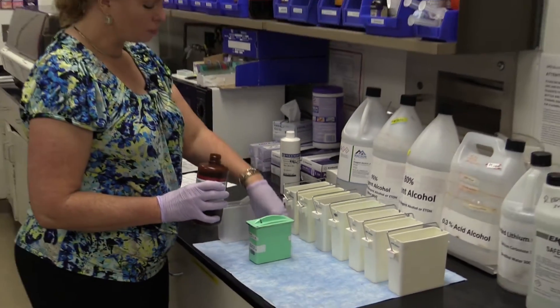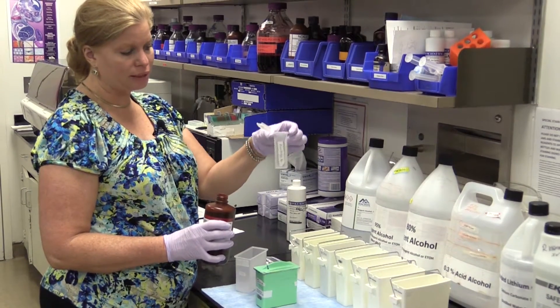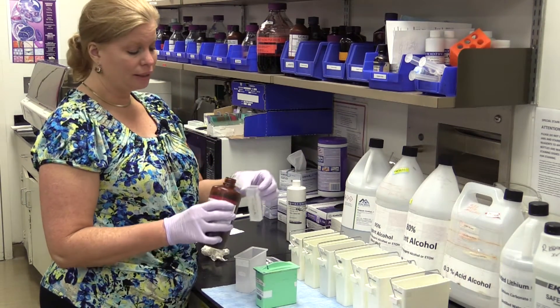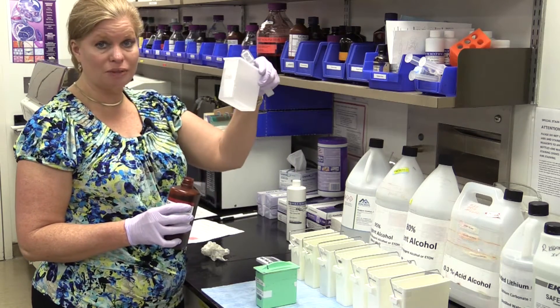Since I just have a couple of slides, I don't want to use a whole big container for the Picrosirius Red and waste it, so I'm just going to use this smaller container which holds five slides and only holds about 15 ml, rather than waste 250 ml in the larger container.